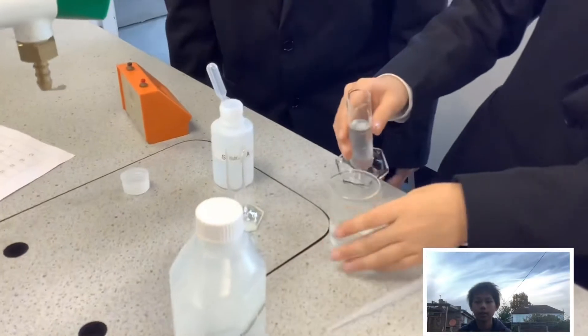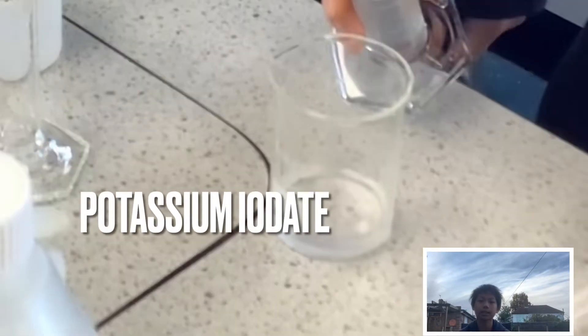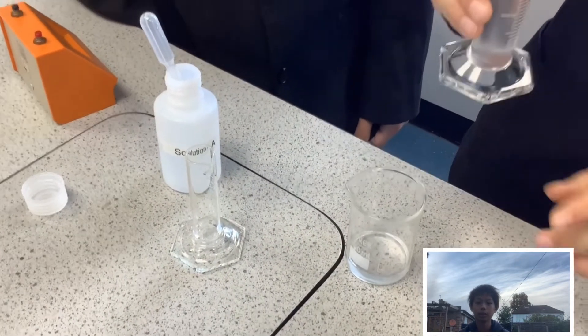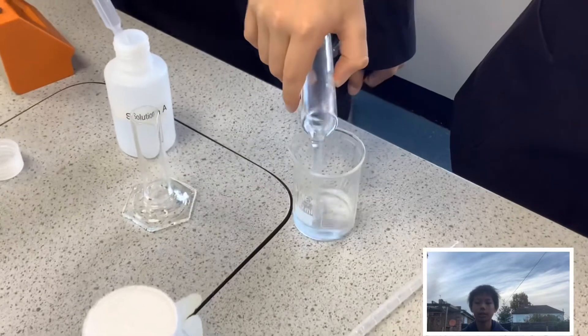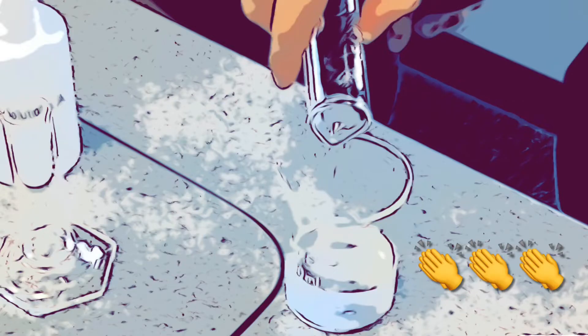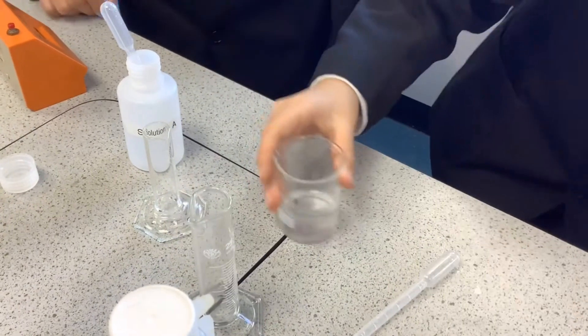Let's begin. First of all, we need to pour in the potassium iodate, which is already in the beaker. Next, we pour a mixture of sodium bisulphite and distilled water into the beaker. This mixes all of the chemicals together. After starting the timer, I mix it.